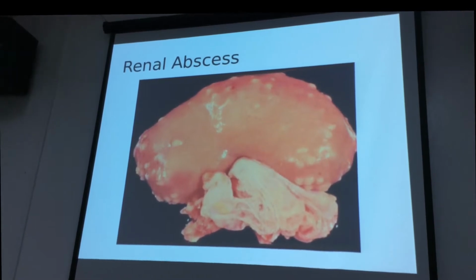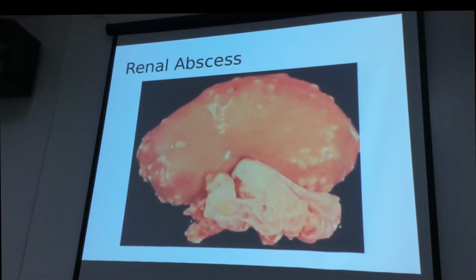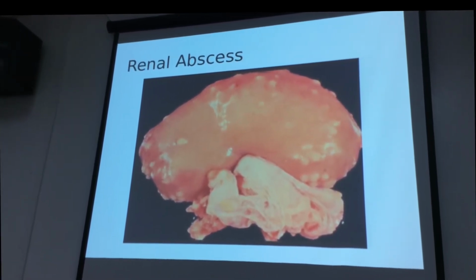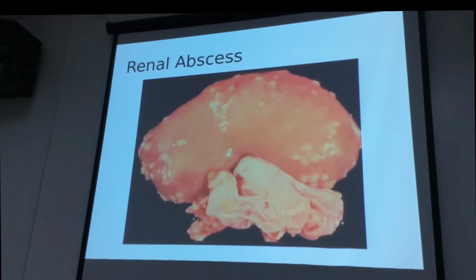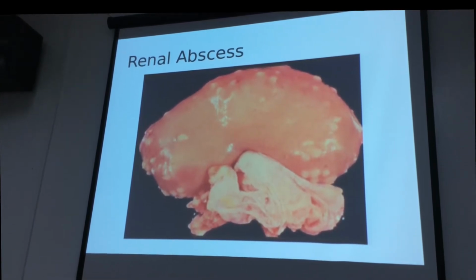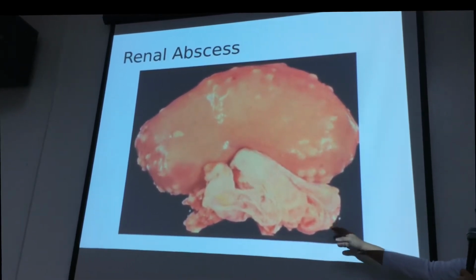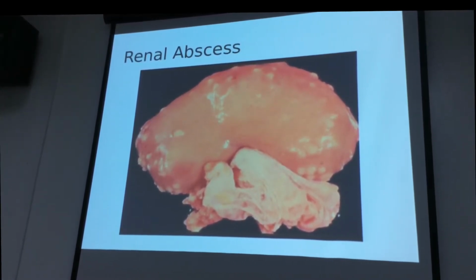Now, you can readily identify that the condition is an acute one because of the smoothness of the renal capsule. More chronic pathologic problems, particularly those that have entered the stage of chronic renal failure, or chronic renal diseases, will manifest with fibrosis of the renal capsule. So grossly, when you try to peel it off, you will have a hard time separating the capsule from the external surface of the kidneys.